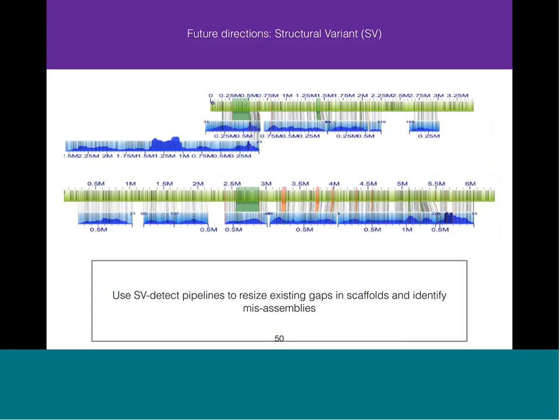I think the end result here is really effective: when you do have a series of ends in your assembly scaffolds, those scaffolds tend to be longer in general for the overall length. And so we can more effectively use those to link BioNano Maps and other NGS contigs together. Can I say one more quick thing here?